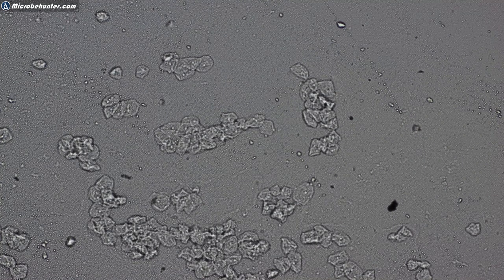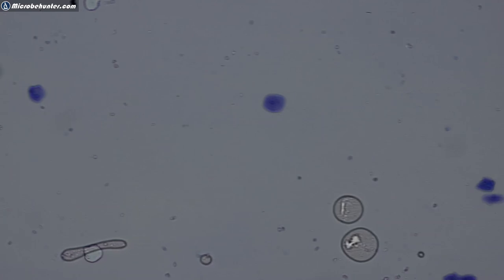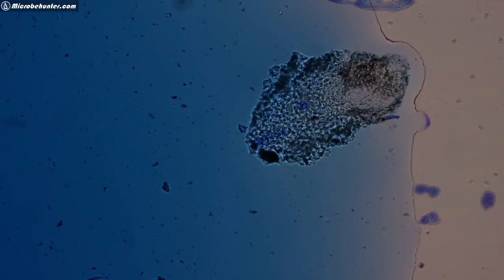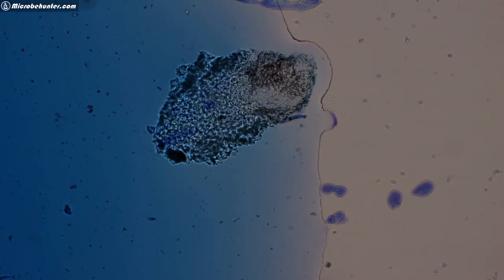And what do I see? Yeah, it's kind of slowly spreading, but it didn't reach the place yet. So let me move over a little bit. Ha! What did I promise you? So here this is where the stain is. There is a little bit of alcohol in the stain, and therefore it kind of mixes now with the liquid, with the water. And look what happens as the methylene blue slowly spreads over.